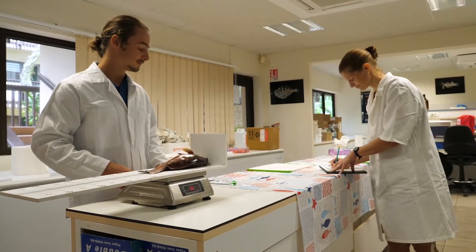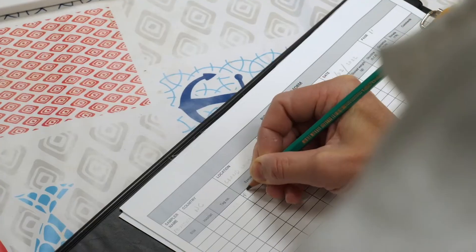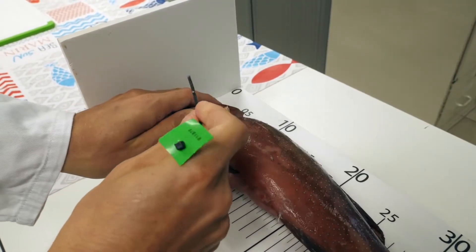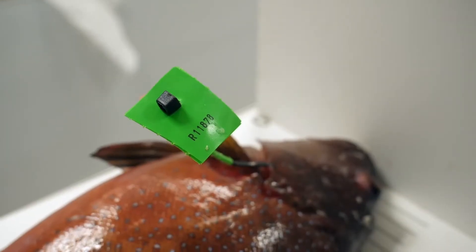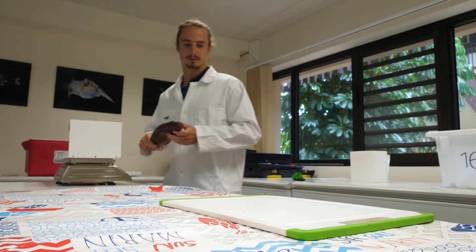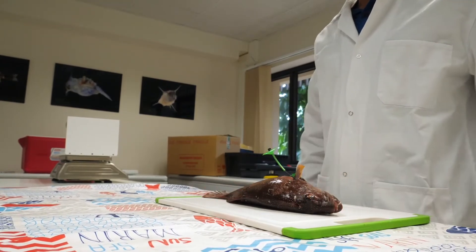At this point, the person responsible for completing the biological sampling form enters the name of the species, the weight and size, and assigns it an identification tag. Place the tag in a location where it will not be lost — for example, by placing a cable tie in the gills. After the fish has been weighed, measured, and tagged, it is ready to be dissected.